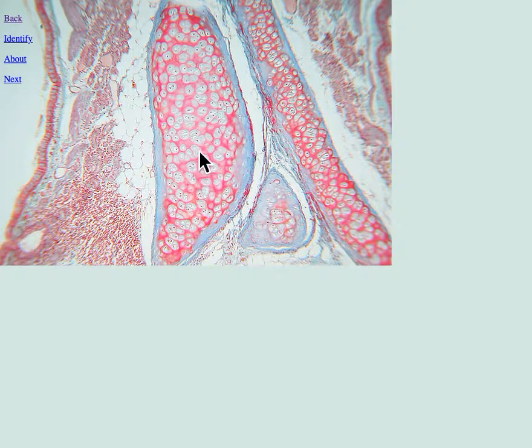Okay. The cells are called chondrocytes, and they live in a little cavity called a lacuna. The membrane that surrounds the cartilage is the perichondrium, and that's going to be an irregular dense connective tissue. And with irregular dense connective tissue, the functional cell will be the fibroblast.